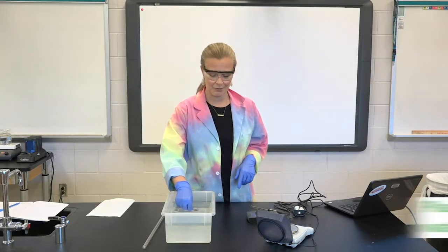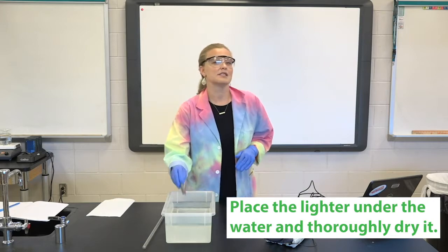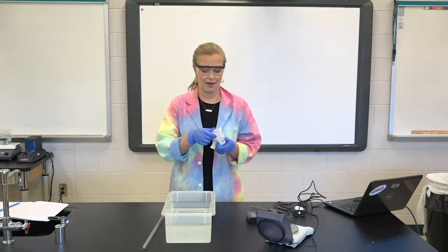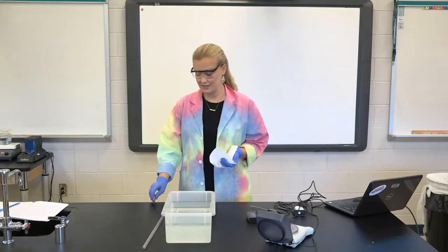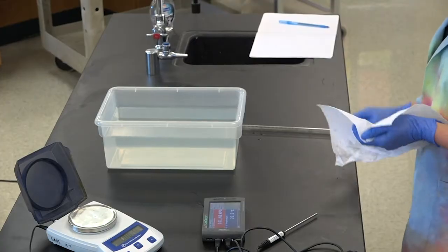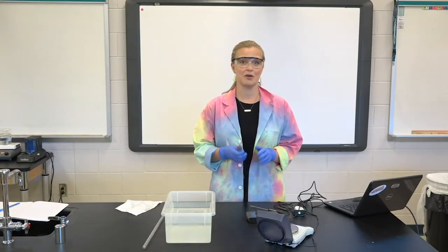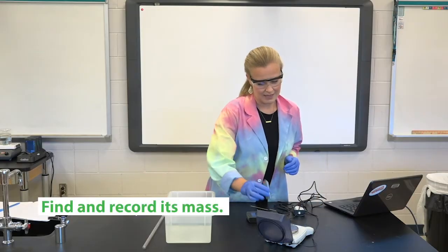Before we mass the lighter, we're going to get it wet — submerge it for just a minute. Throughout this experiment, we're actually going to have the butane lighter underneath the water, so it's going to be a little bit wet at the end. If it was dry at the beginning and wet at the end, we would have some difficulties with our calculations. So just dip it in the water, get it wet, and then dry it off as much as possible. This way we know that if the mass changes, it was because butane left the lighter, not because of water.